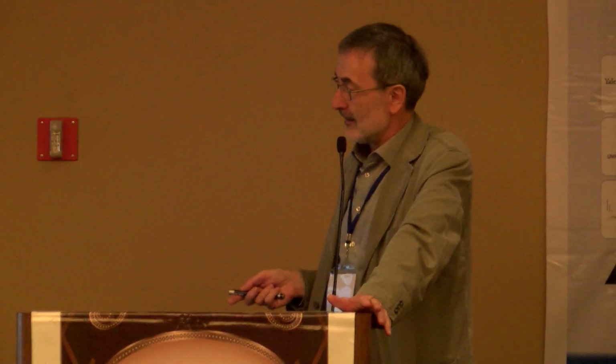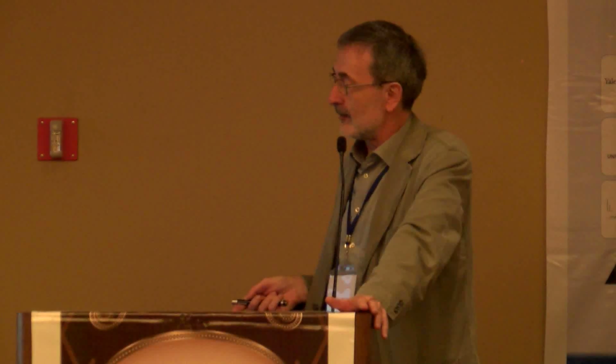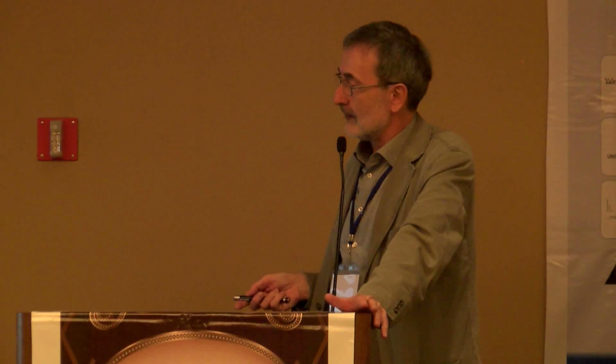So we went back to extraction and detecting the metabolites by proton NMR spectroscopy, comparing the spectra which we detected with the spectra of reference material of nicotine.